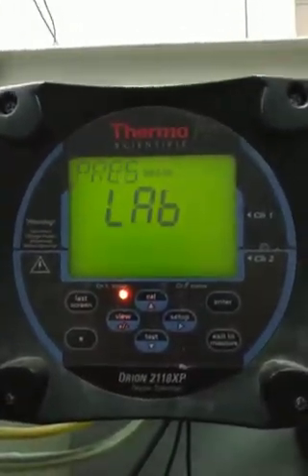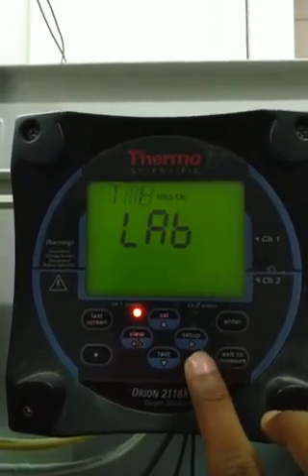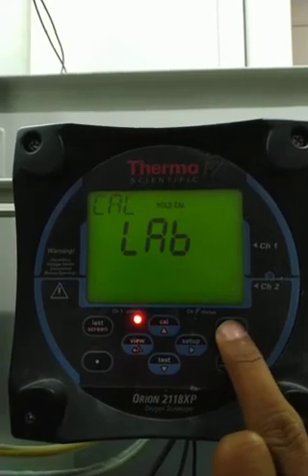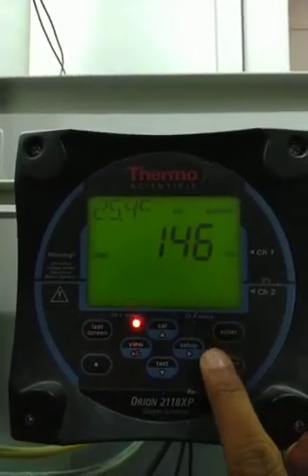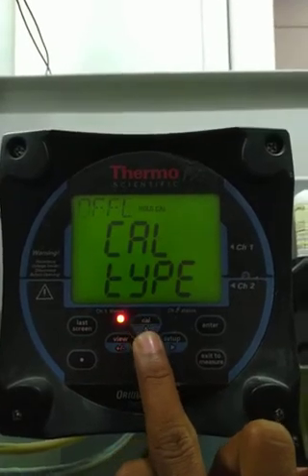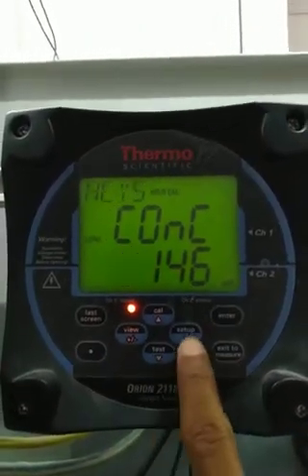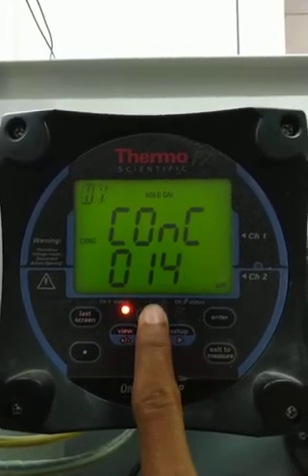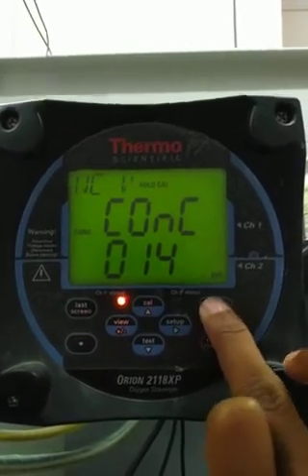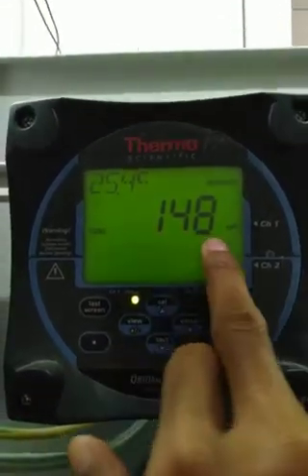Now I will collect this drain. It will be 148. I will enter the current drain value. Then I will collect it and come back to this drain. Then we enter 148 PPM.